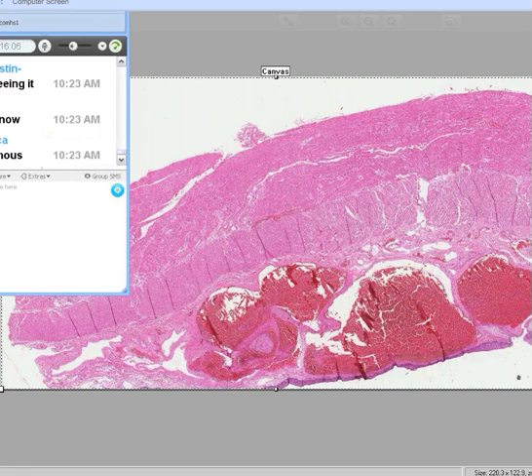Jessica, you are kicking ass today. Of course it's squamous because it looks like squamous. So if I told you that this was a GI organ and you see a lot of smooth muscle and it has a squamous mucosa, then what part of the GI tract is this? Of course it's an esophagus.